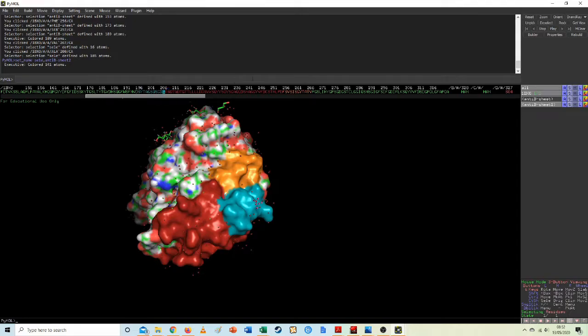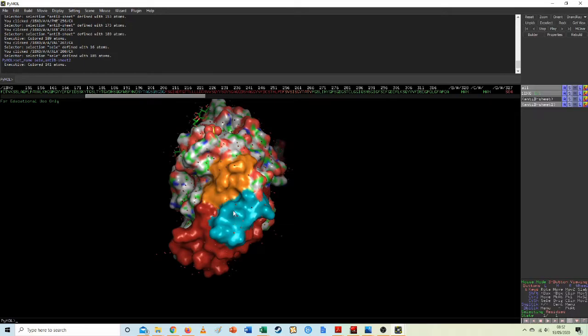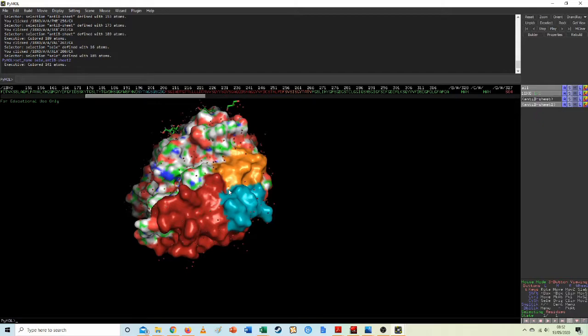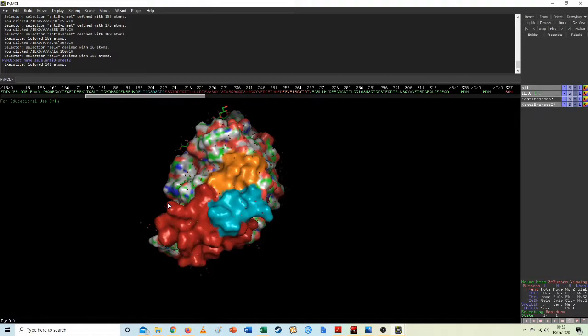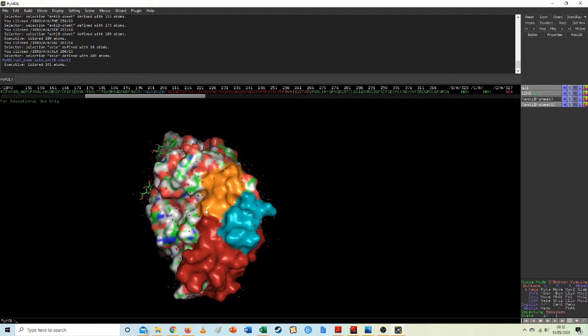Now, between those two bits that are side by side, we've got all of these other residues. And then we've got this. However, when we look at the structure of the protein, these are actually side by side, and they're helping form this anti-parallel beta pleated sheet, and that gives us that very specific surface that we have there. Now, that is probably not hyper important for the active site, but it will be important for the overall function of the enzyme.